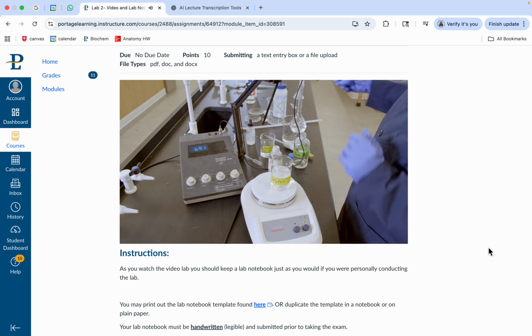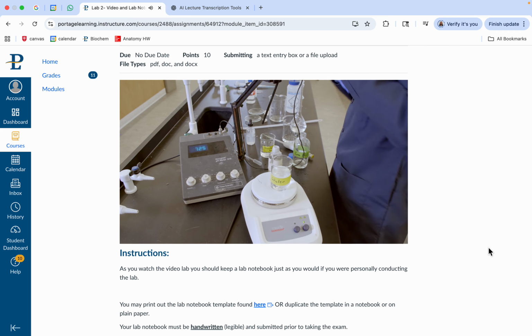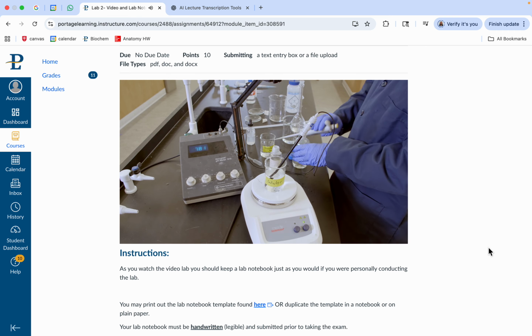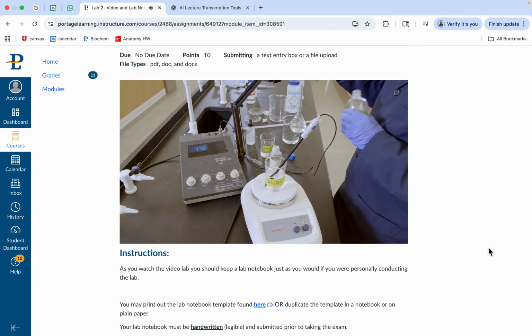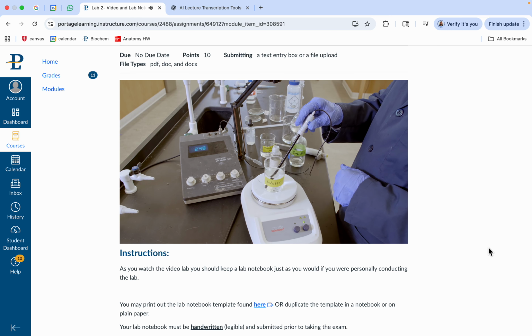Now let's compare that to approximately the same volume of water. We have about 120 milliliters of water. We'll make sure that in between, using our pH probe, we clean that off, and we'll add our pH probe to water. Again, noticing water, it's a little bit higher, but still sort of in that pH 7 range. It's about 7.8, so it's higher than our buffer. Let's add a little bit of HCl to it and see how it changes.